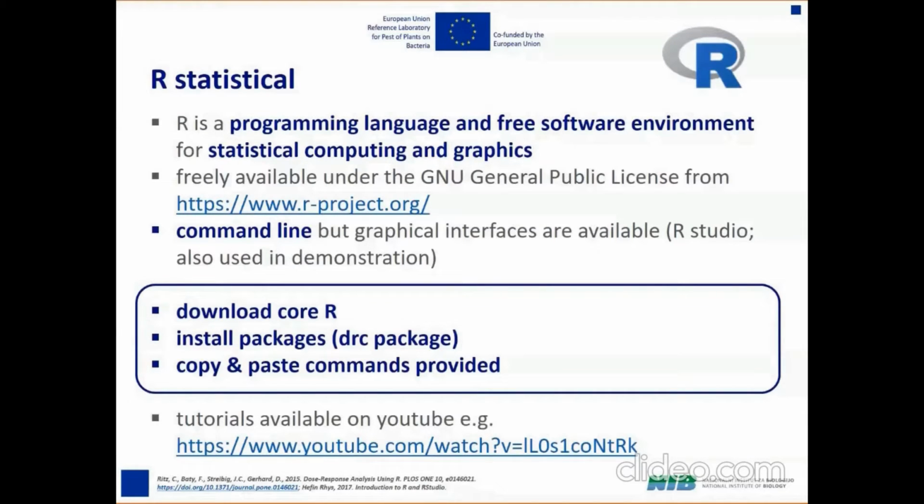So we need some tools that will help us with that. And what we are using is R statistical. As I wrote in the introduction to the lecture, which was in the program, there are, of course, professional programs that do the same thing. Of course, there are many programs that can do nonlinear modeling, but this one is a free software environment, and we find it useful. So we thought that we will try to share our experience with that.